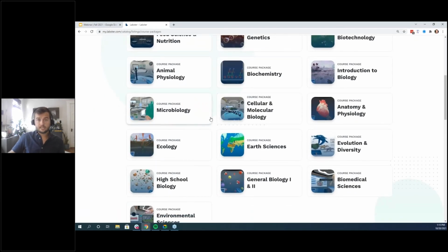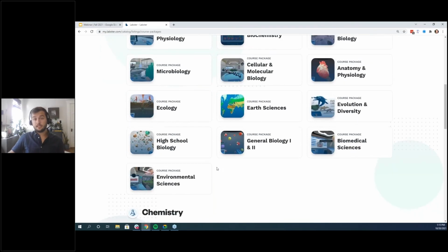Microbiology is a really fantastic one. Many people that I speak to say microbiology is a big use case for Labster. And we have partners all across the globe. If you're interested in hearing more about schools that maybe are doing things similar to yours, we can definitely connect you with different case studies. Or when you talk to the rep, they can take a look at your syllabus and say, here's some simulations that I would recommend that would really pair well with your learning objectives as is.